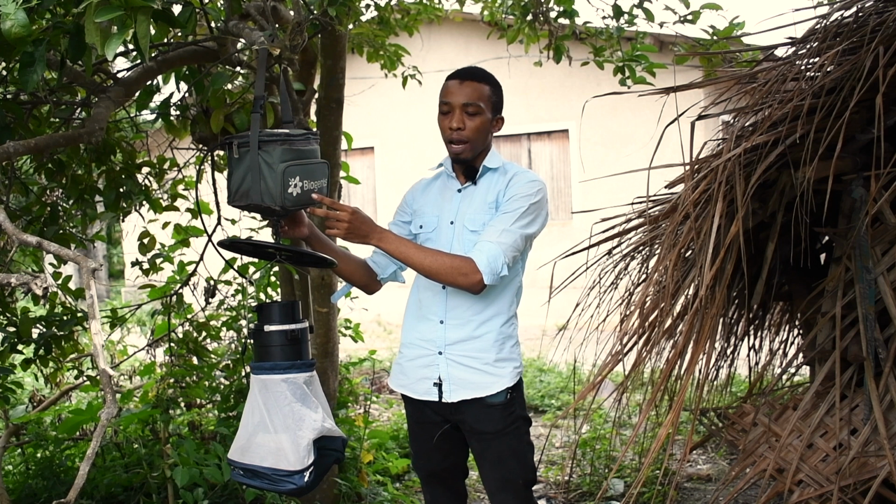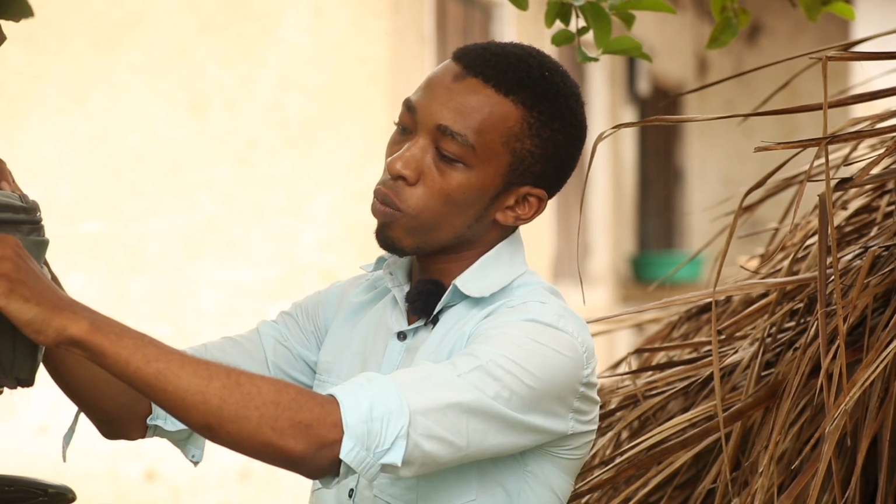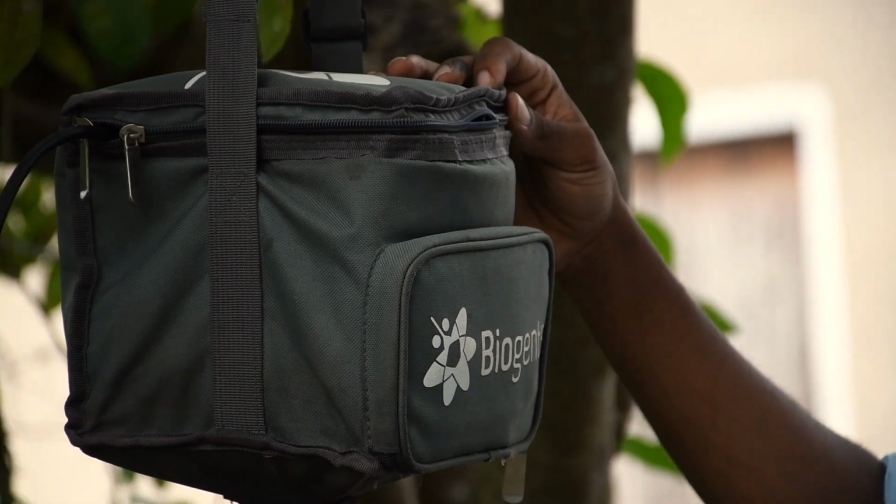This is the BG trap. The BG trap consists of many components. We have the bag right here, which we use to store the carbon dioxide generator, and the tube, which then transfers the carbon dioxide to the trap door.